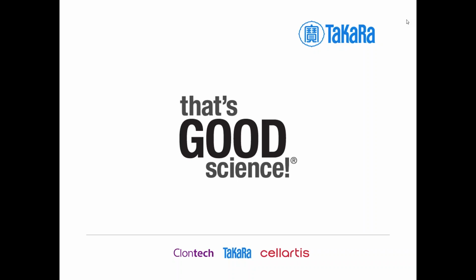There's one question, whether you can use the mini prep column first for screening and then move to the maxi prep. This is certainly possible. The mini prep is quite good for testing the technology, and then if you need more protein, you can easily switch to the maxi system. The protocol stays exactly the same, the technology is the same, and if it works for the mini prep, then it will also work for the maxi prep. So it's an easy way to scale up your purification.